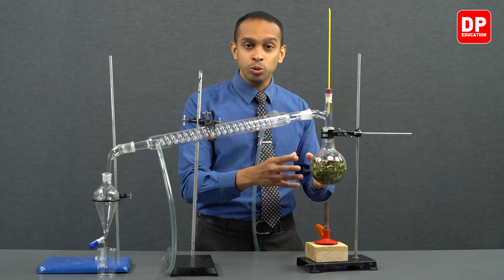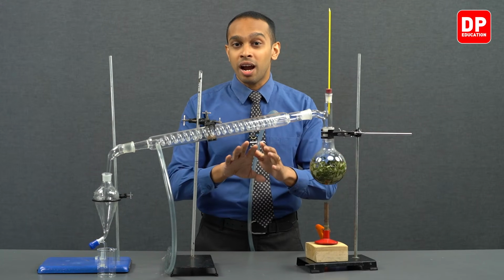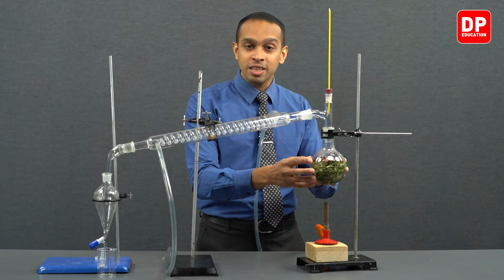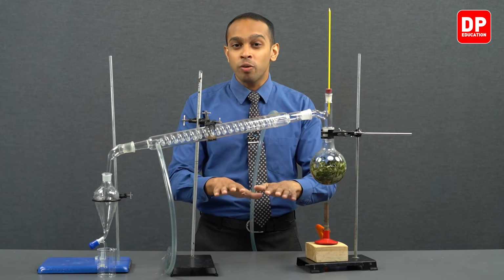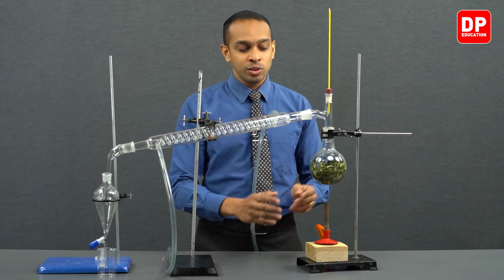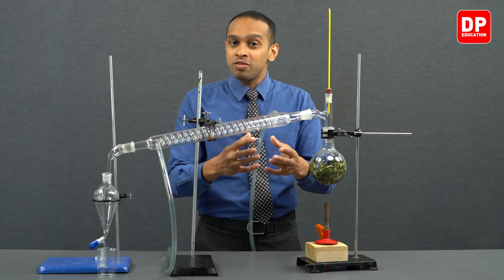This allows the essential oil to come into gaseous phase at milder conditions. So this will ensure that the essential oil that we have extracted has not undergone decomposition. So we allow the essential oil to boil at a lower temperature or a milder condition. So this essential oil that is boiled is going to be mixed with water vapor as well.